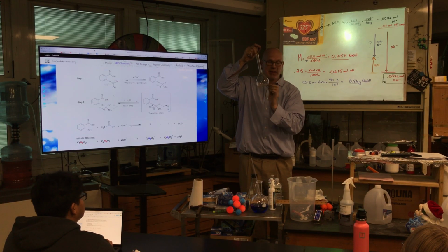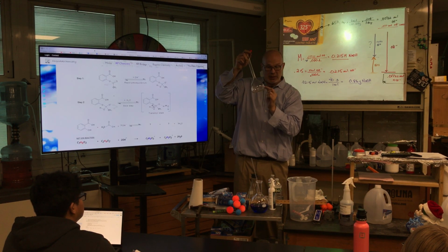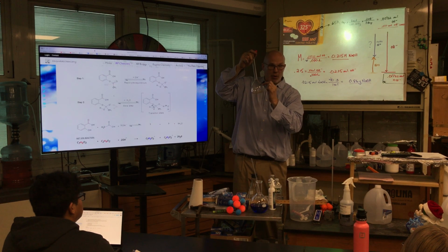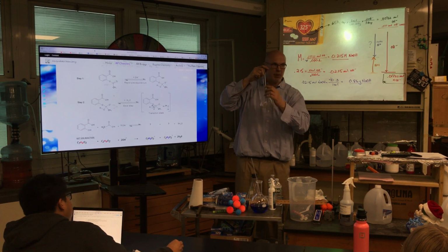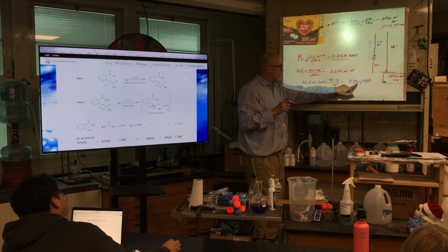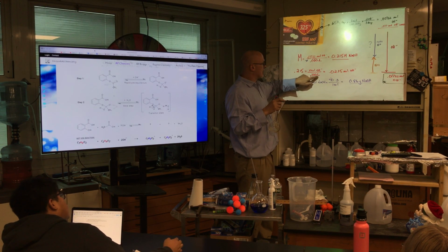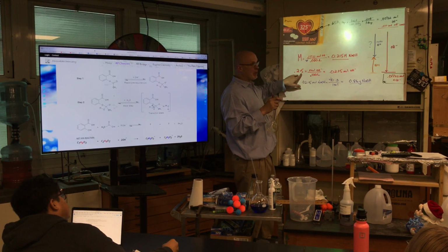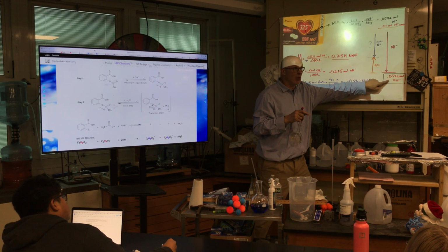Well, actually, you're going to add some, get all the solids in, use the wash bottle, make sure all the solids are in here. Add distilled water, pre-dissolve it, and dilute to the 100 milliliter mark. That many moles diluted to what? 0.1 liter gives you that molarity. We need that molarity because 80 milliliters of it will deliver those moles.